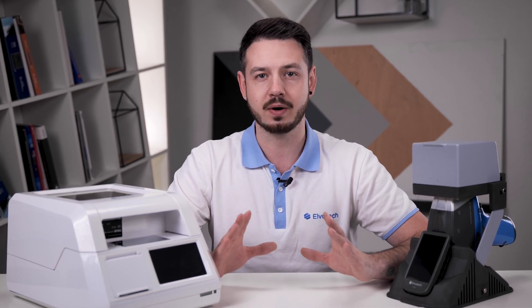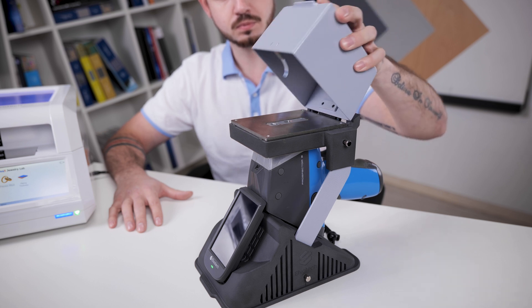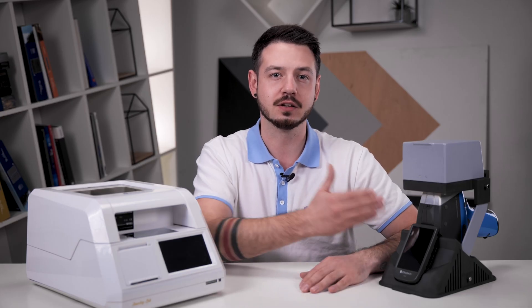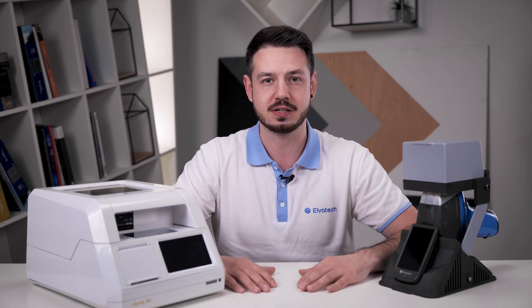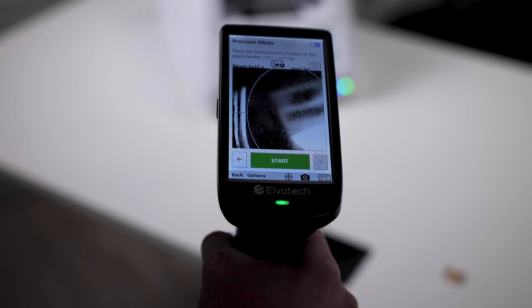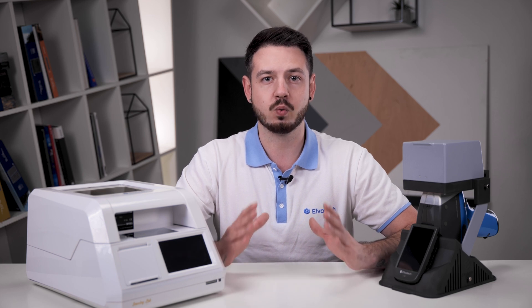If mobility and the ability to analyze anywhere is important to you, the Prospector 3 is the perfect partner. You can take this handheld compact analyzer with you wherever you go, and it is as fast and accurate as a benchtop analyzer. The Prospector 3 features a large 4.3-inch folding display for comfortable standalone operation without needing to connect to a PC. It also has two built-in CCD cameras with backlighting for macro and micro shots, two collimators for accurate analysis of small objects, and over 16 hours of battery life with a hot-swap function — important when working in the field.